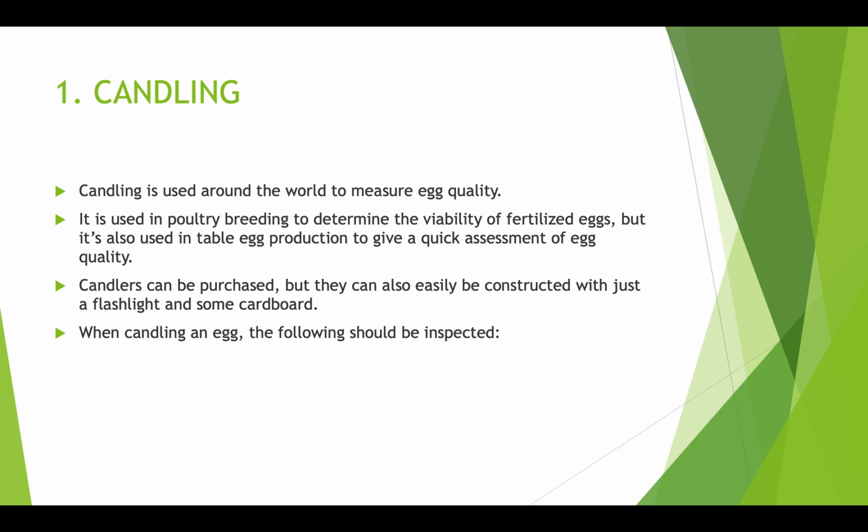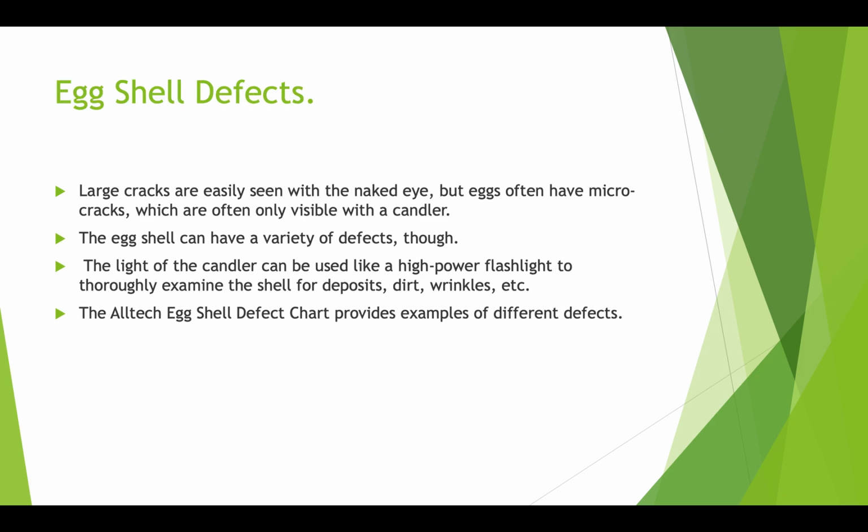When candling an egg, the following should be inspected: the eggshell defects. Large cracks are easily seen with the naked eye, but eggs often have micro cracks which are only visible with the candler.